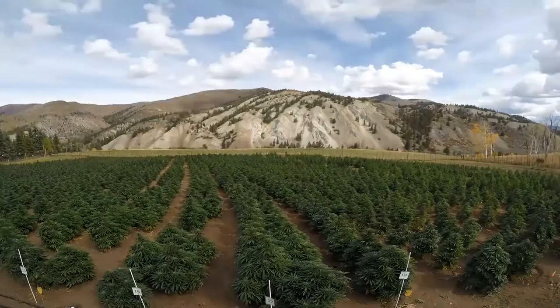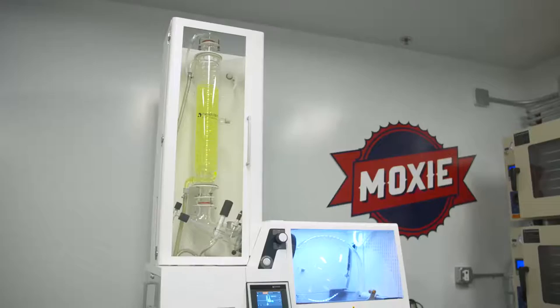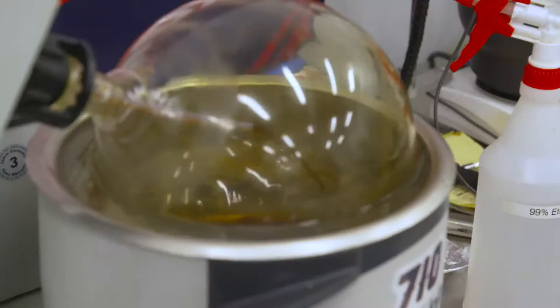Today, rotary evaporators are used for ethanol solvent recovery when producing liquid for electronic vape pens. At their production facility in Las Vegas, Moxie uses rotary evaporators in the final stage of winterization, a process that is vital for producing extracts pure enough to be consumed in vape pens.